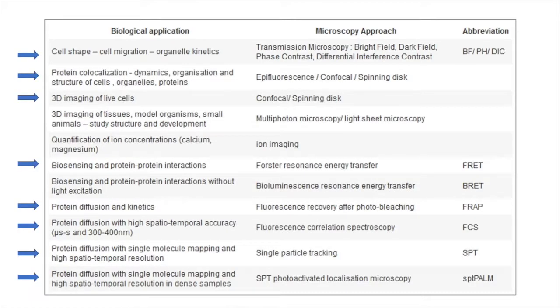Some of the biological applications I already mentioned. In the interest of time, I won't dwell on this, but again, there are a number of really exciting things, and the applications are proper for certain techniques, such as, let's say, confocal spinning disk.